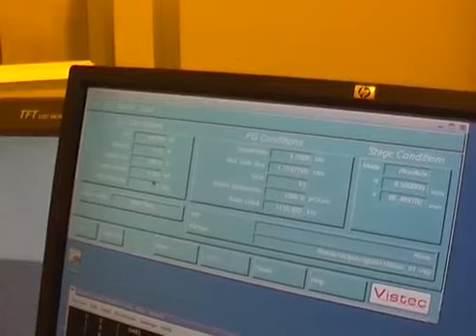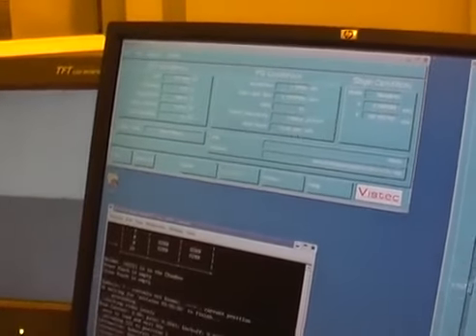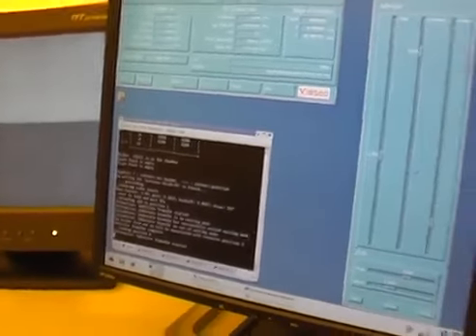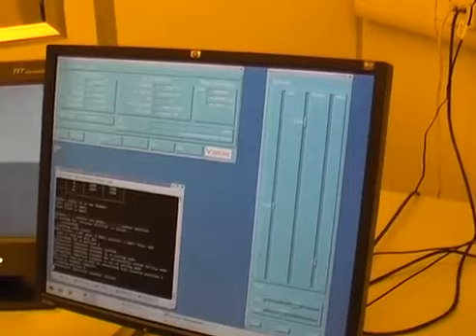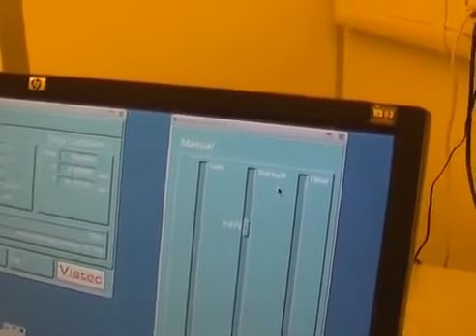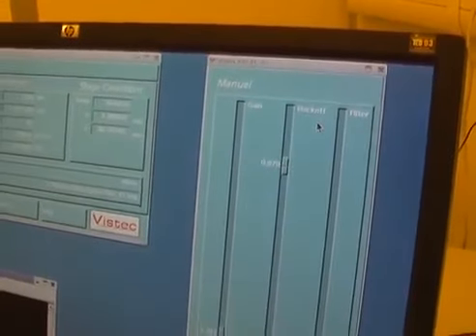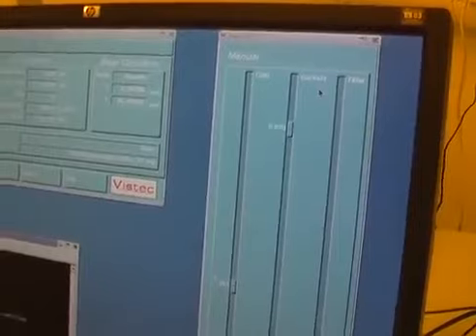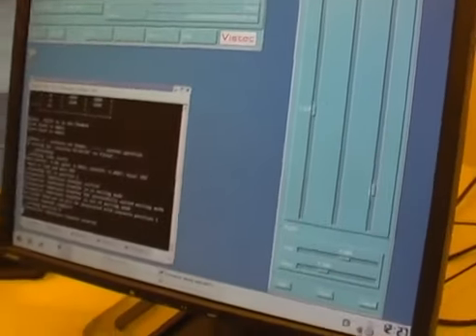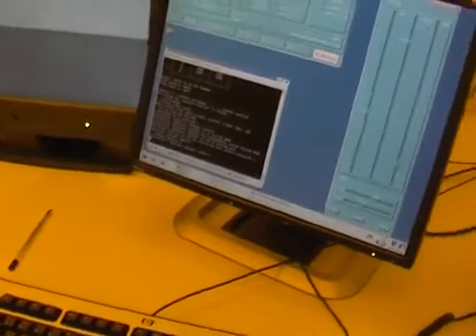The beam current is 3.99 nanoamps, and various other parameters across here. This display is quite useful. It's the gain and back off, which for an SEM effectively means gain is contrast and back off is the background level we can raise or lower. And those are what we'll use to get a good image on the SEM screen.